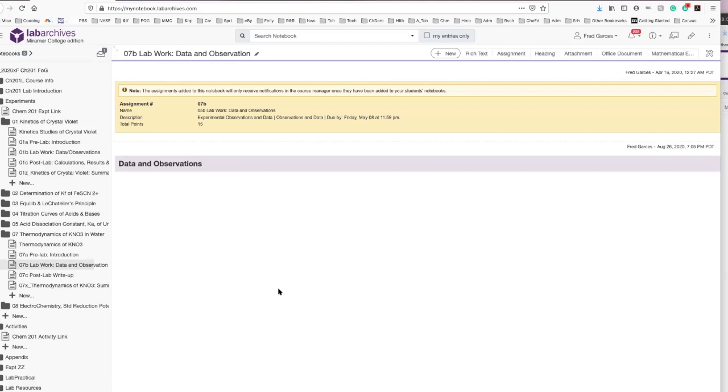And it's good to learn, because with all this going on where everything's being electronic, everybody's working at home, that's the way of the world. Everything's got to be digitized because we want a permanent record, and the way we do a permanent record is much easier using a digitization format.